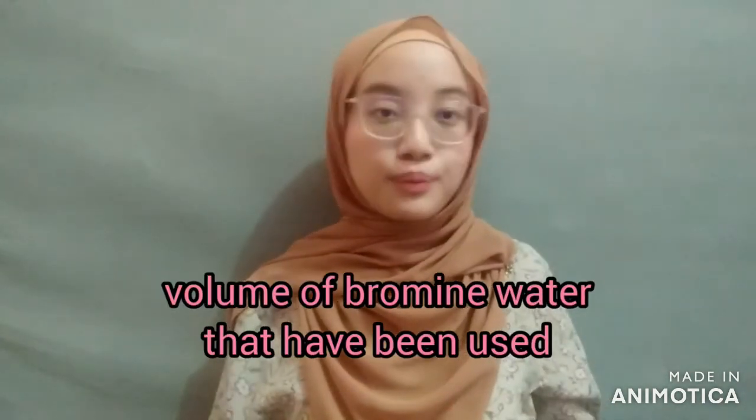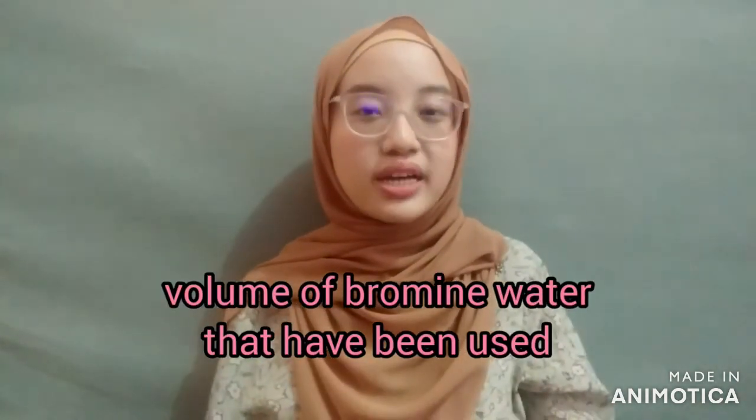Okay, so the result is based on the volume of bromine water that we used to decolorize the lipid solution until it turns slightly yellowish. In this experiment, we used 4 types of lipid samples, which are coconut oil, palm oil, corn oil, and sunflower oil. Among these 4 types of oil, sunflower oil is the one that used the most volume of bromine water to decolorize its lipid solution until it turns slightly yellowish.